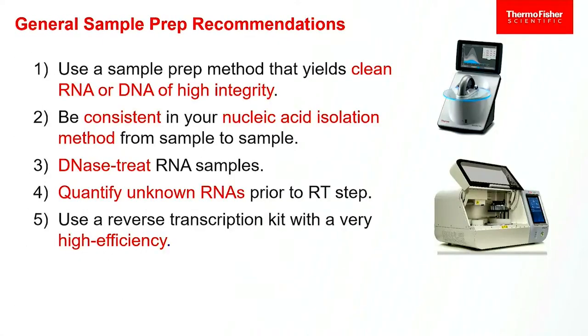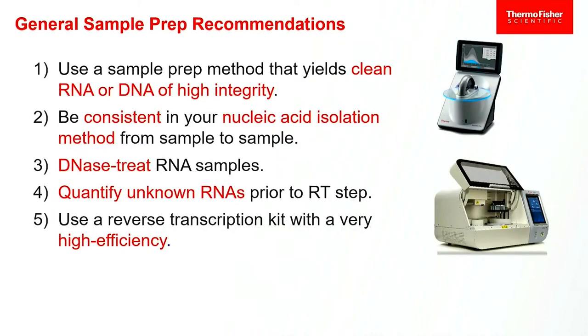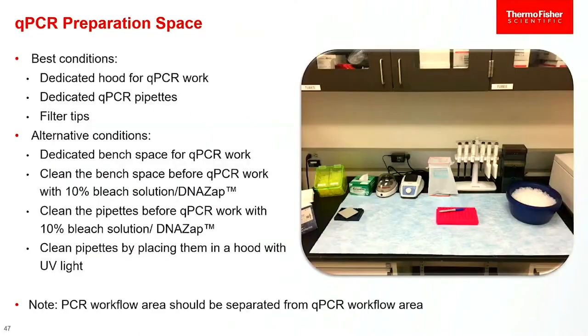It's nice to know how much RNA you're putting into your reactions, because if you put in too much, you can overwhelm the reaction and overwhelm your enzyme. So it's good to know how much goes into those before you start, and making sure you have a high quality reverse transcription reaction. Using our kits is a really good option there.